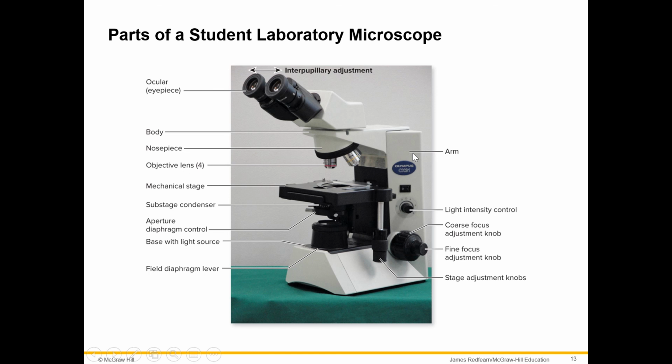When transporting a microscope, you always want to have one hand on the arm and one hand on the base.